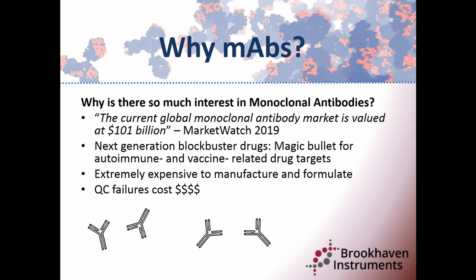Why are we interested in monoclonal antibodies? So where does this interest come from? It's one of the fastest growing classes of pharmaceutically active biologics. So what we're really talking about is monoclonal antibodies. They're synthetic recombinant proteins produced in cell culture.